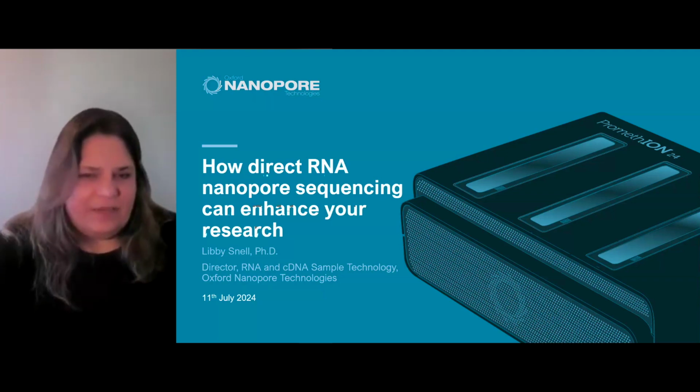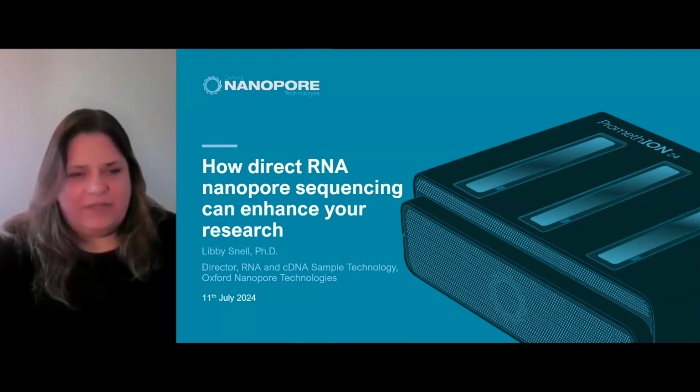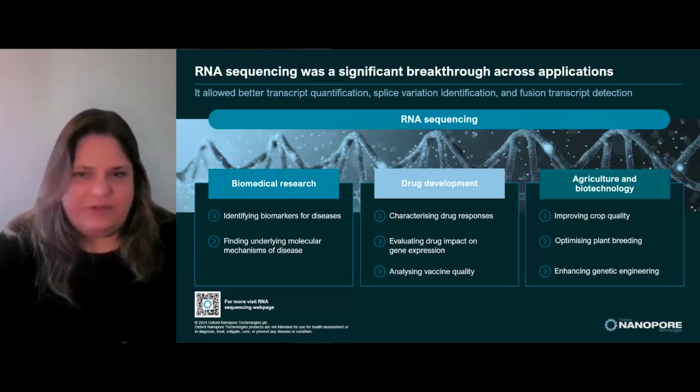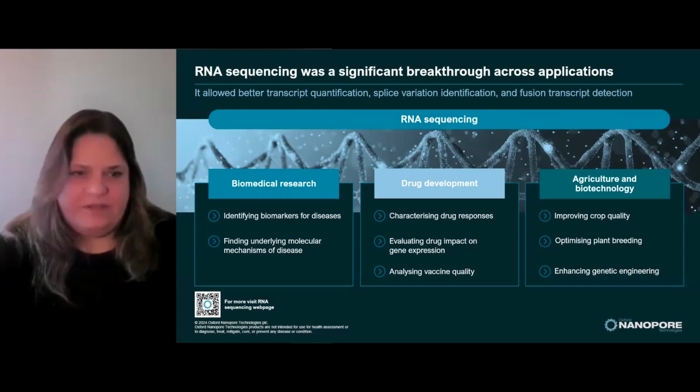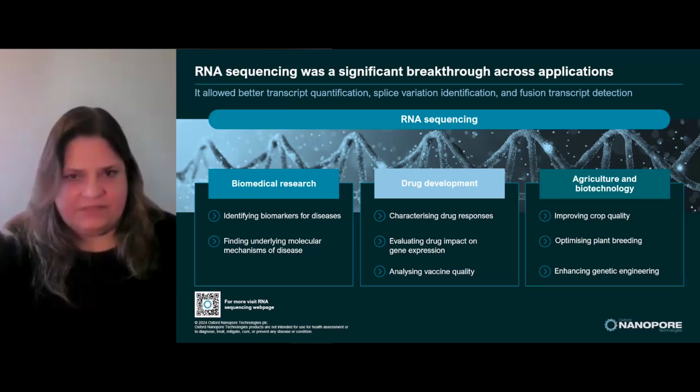So I am very happy to walk you through some of the attributes of direct RNA sequencing and how it can be used to enhance your own research. By way of introduction, I'm going to give you some background on RNA sequencing in general, and then move into why direct RNA sequencing is such a good fit for a lot of different questions that you might have.